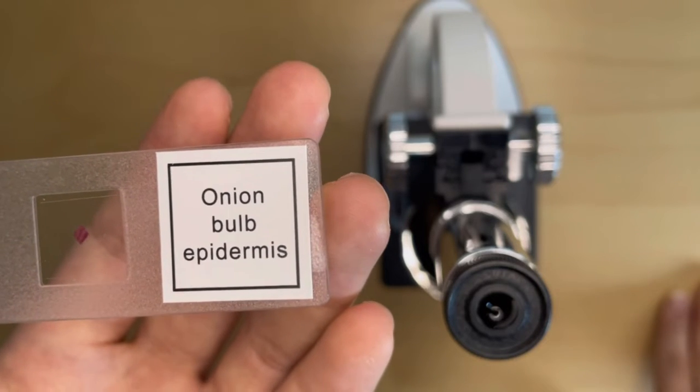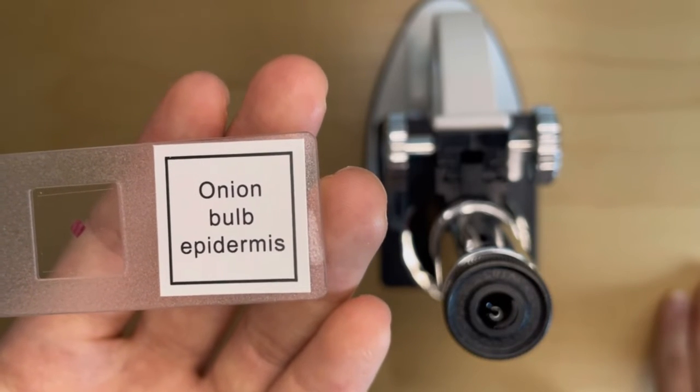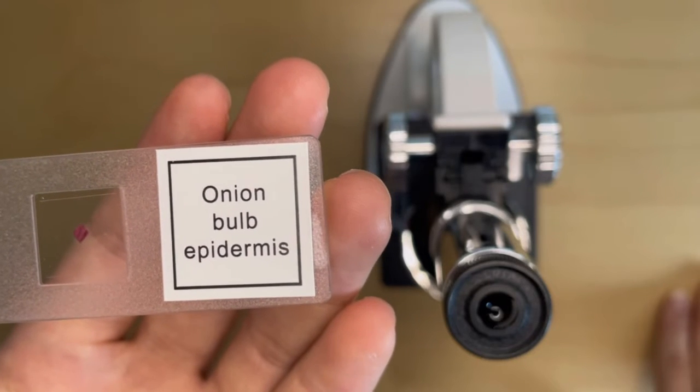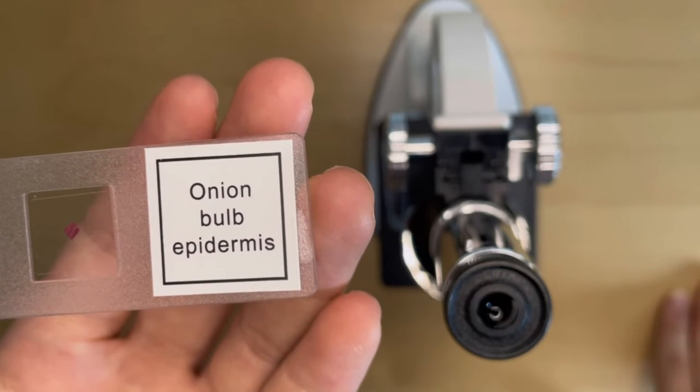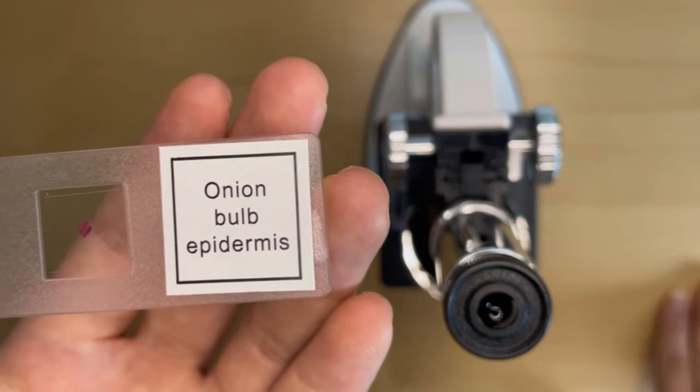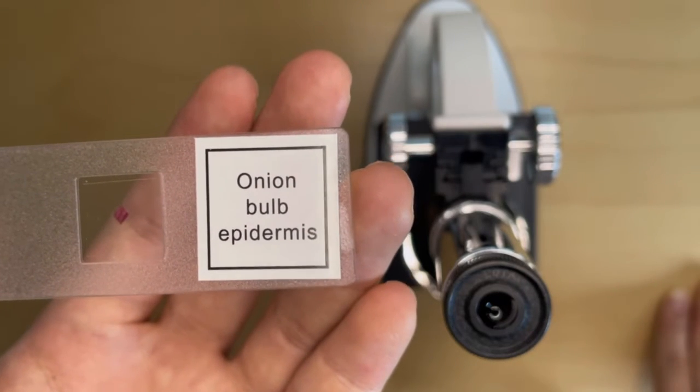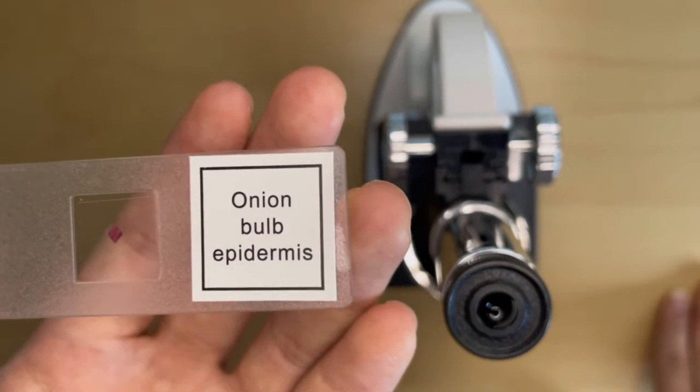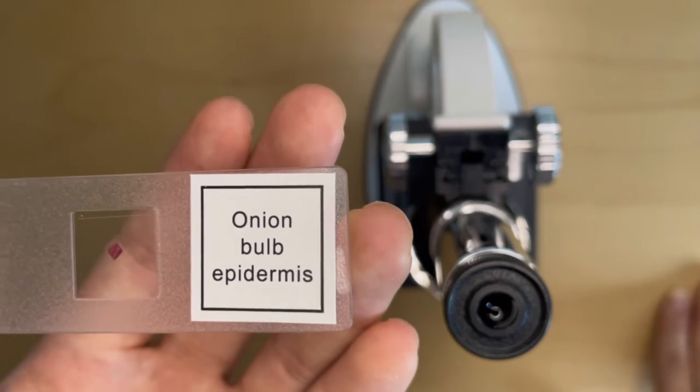The skin is the largest part of our body, so the bulb epidermis is the outer layer of an onion, but helps to protect the onion. And also it's growing. Okay, let's see how it looks like.